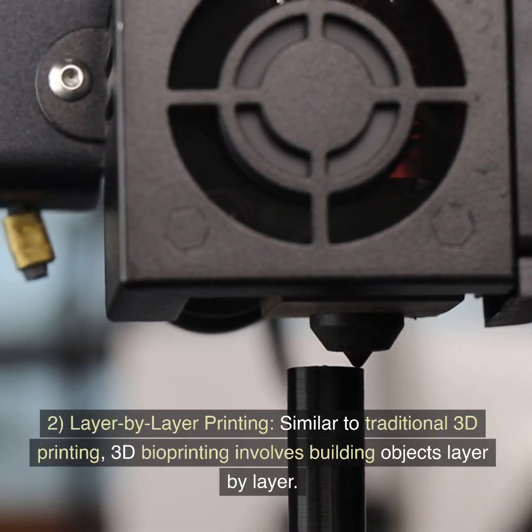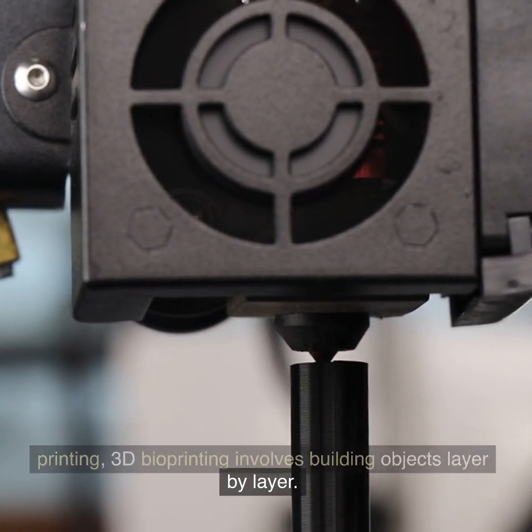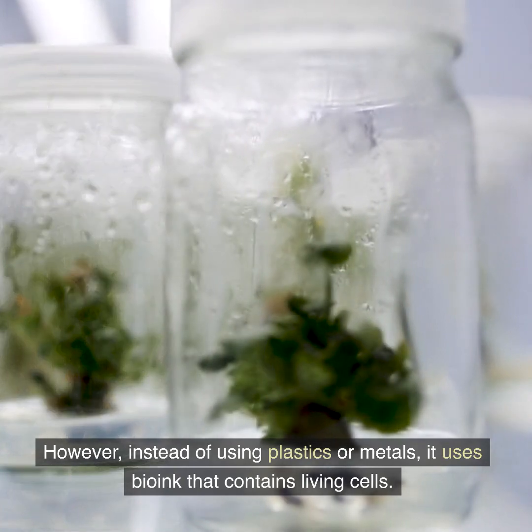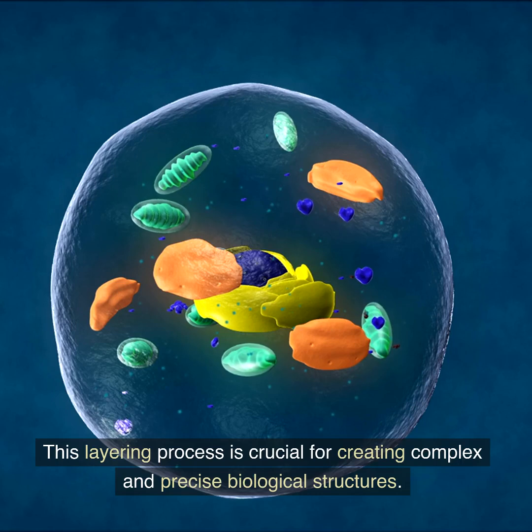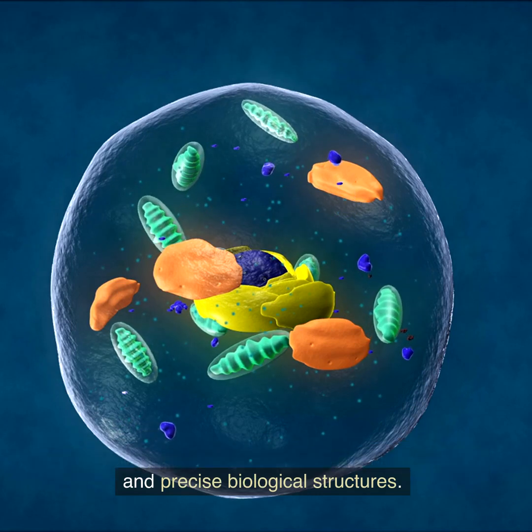Similar to traditional 3D printing, 3D bioprinting involves building objects layer by layer. However, instead of using plastics or metals, it uses bioink that contains living cells. This layering process is crucial for creating complex and precise biological structures.